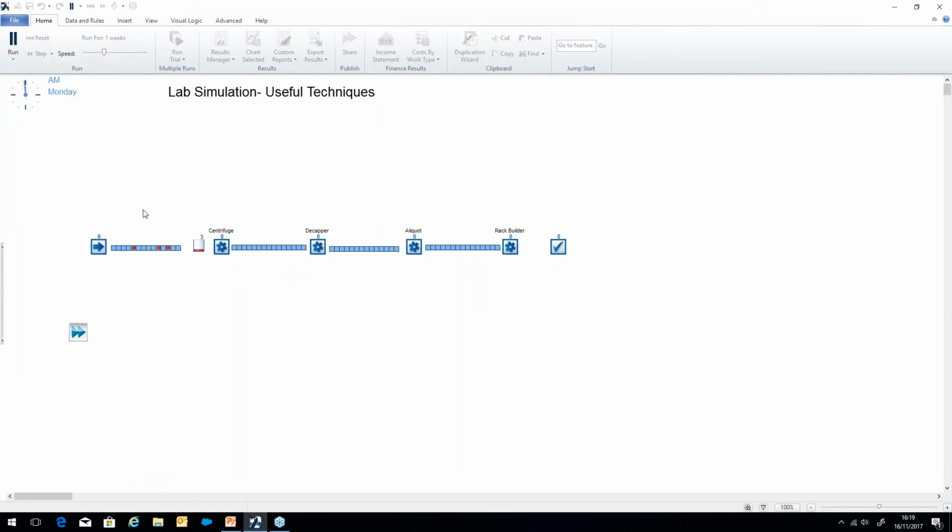We always like to have some results on screen as well, so you can visualize. We've got utilization charts here that show what percentage of time we're working or waiting, which is going to help you see which parts of the system are most busy. And this is obviously going to change. If you make a change to one part of the system, it's going to change the utilization elsewhere. So being able to see that as you make the change is really powerful.